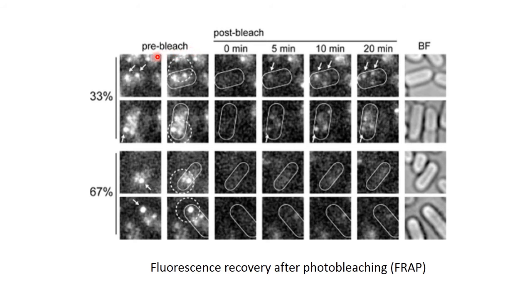These are the images which are taken before bleaching. Later, when bleaching was done, you can see that fluorescence has been lost in this region of the cell. After bleaching, as time is increasing, you can see that the proteins from the neighboring area are going to migrate into this region, and later it is going to increase the fluorescence intensity. In this manner, the fluorescence is going to recover.